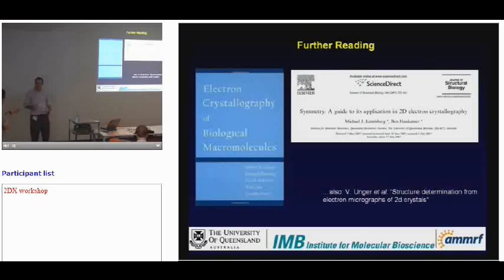How reliable are the automatic procedures in order to find the symmetry in normal imaging conditions? Do they normally work? Treated correctly, they normally work.